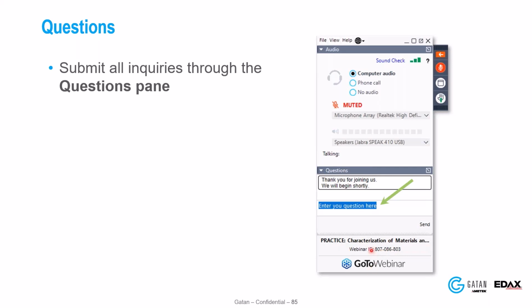You mentioned NPar a lot with this. So NLPar also works, yeah. Within both, you can select, basically, it's labeled within the software. I should repeat the question just in case I didn't hear you. The question from Dan was, I mentioned NPar and also a little bit NLPar, which is the non-local averaging approach. Both of those, Dan asked if they were both available, and yes, they're both available within OIM Analysis.